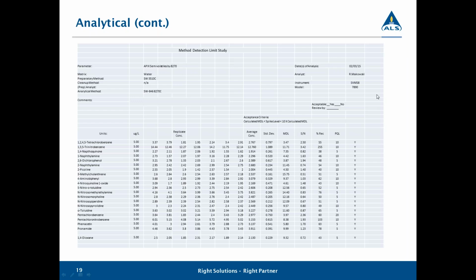In this particular one, the average percent recovery was 43%. Which isn't horrible compared to some of the semi-volatiles, but again, it is on the low side. Some of the normal things, some of the PNAs and some of those type of compounds typically are going to recover in water around 70–80% or more. So it kind of gives you an idea of the efficiency there.